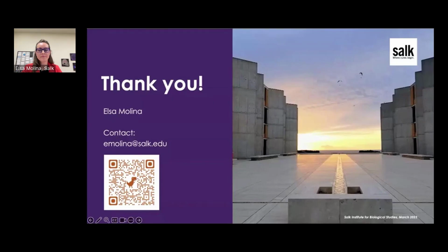Another great question that we've had here, obviously you've compared a lot of different technologies. Do you think that there is an opportunity in the future for standardizing spatial transcriptomics protocols and data analysis pipelines, or do you think that will stay quite separated, dependent on the technology that you're using?